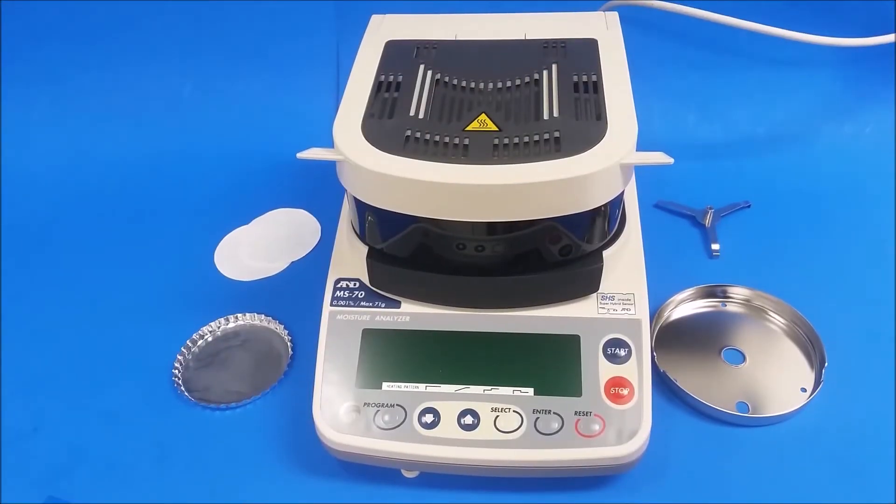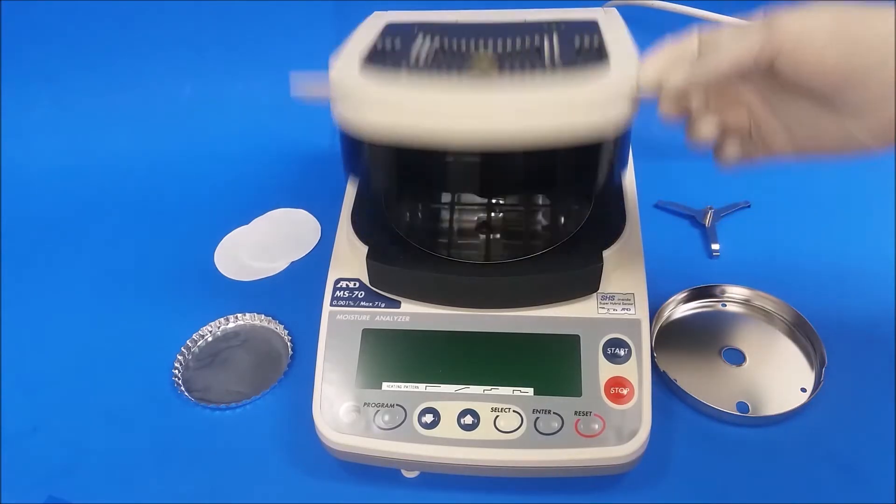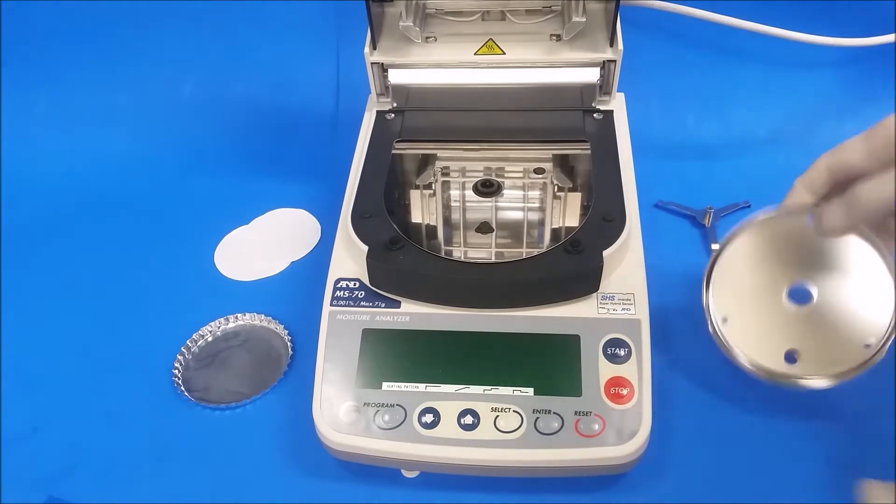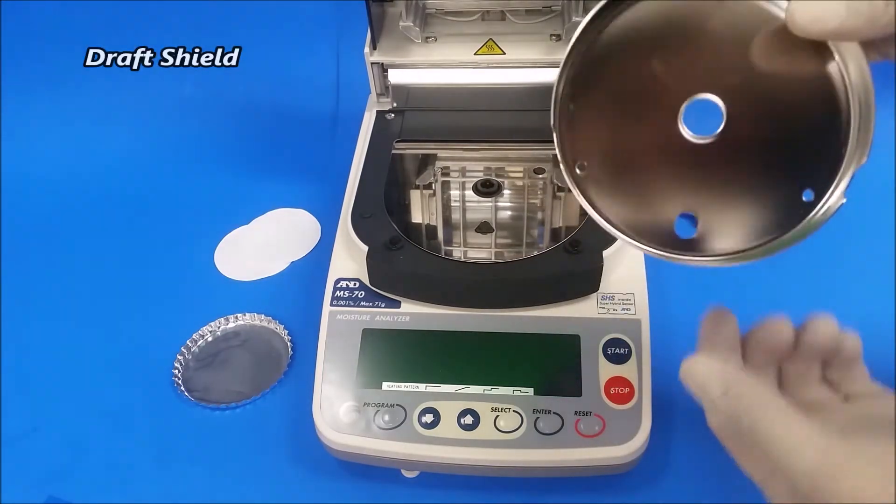Hello everybody, DSC guy here. Today I'm going to show you how to run a test on your A&D MS-70. First we're going to put in its parts. The first piece will be the draft shield. There's a little hole down here that should match on this little dot here.